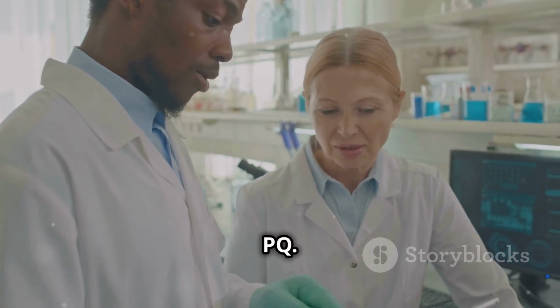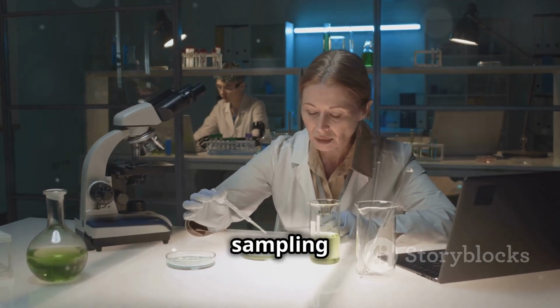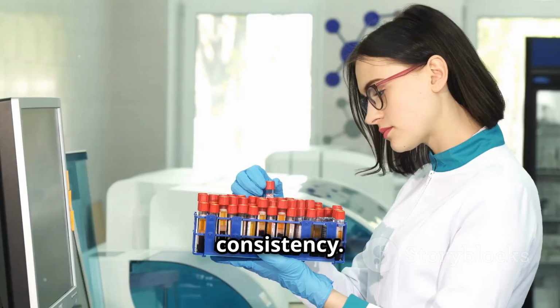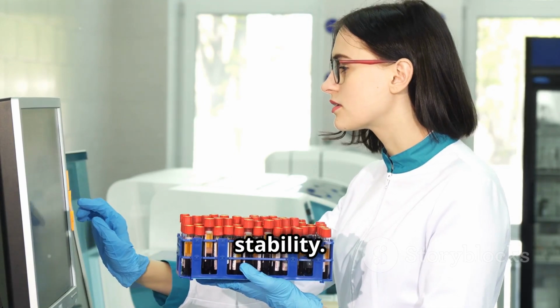Performance Qualification, or PQ. Sampling protocol. Phase 1 involves daily sampling from critical points over 2 to 4 weeks. Phase 2 includes bi-weekly sampling to confirm consistency. Phase 3 consists of monthly sampling for 1 year to verify long-term stability.